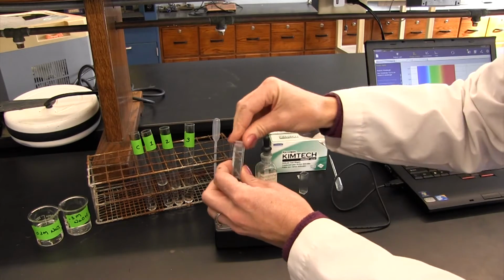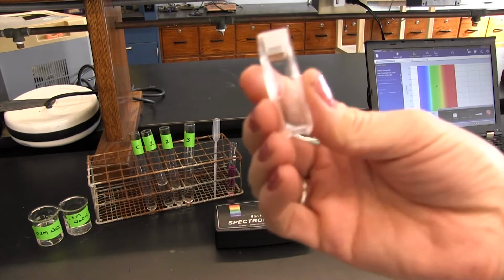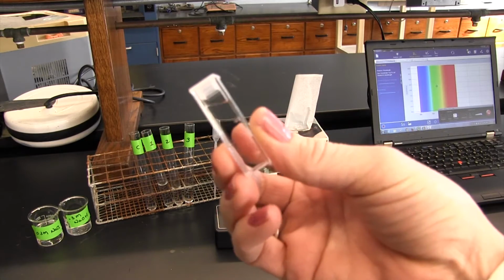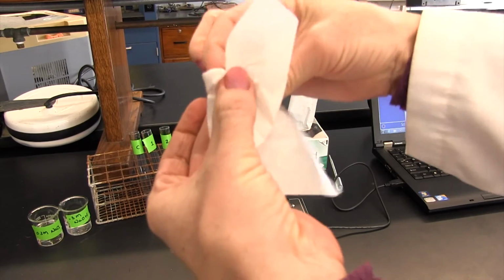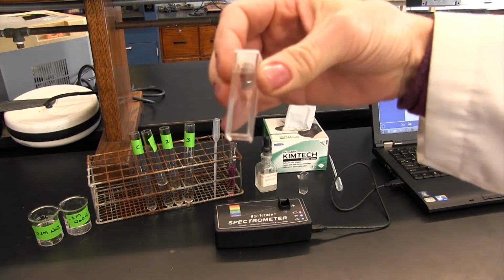And we cap it. The important thing to note about these cuvettes is that there is a clear side and there is a side that has lines on it. So you want to hold the cuvette so that your fingers are always on the side with the lines. And this side has to remain completely smudge free. So you can clean it if you have to.